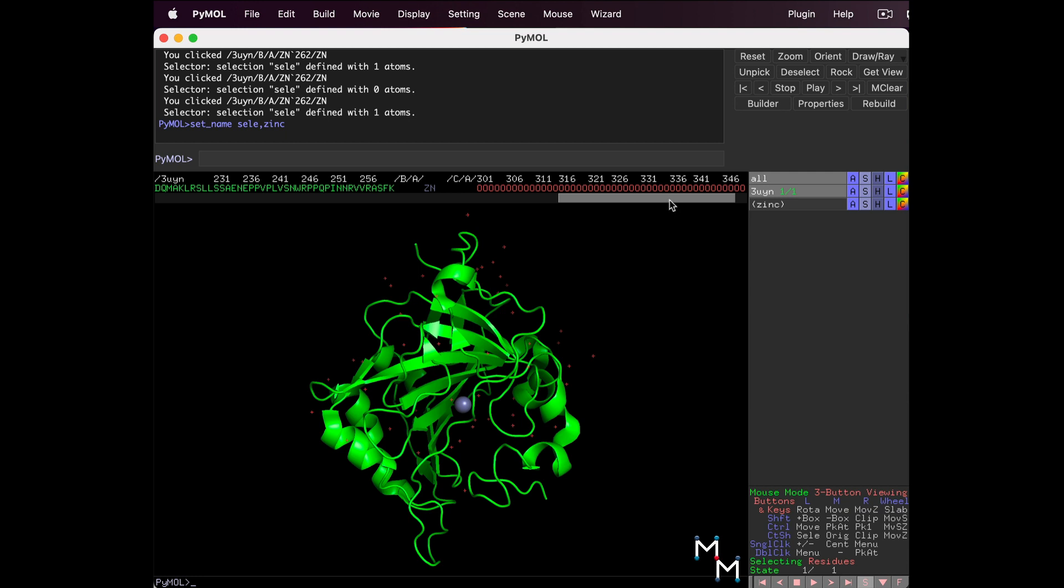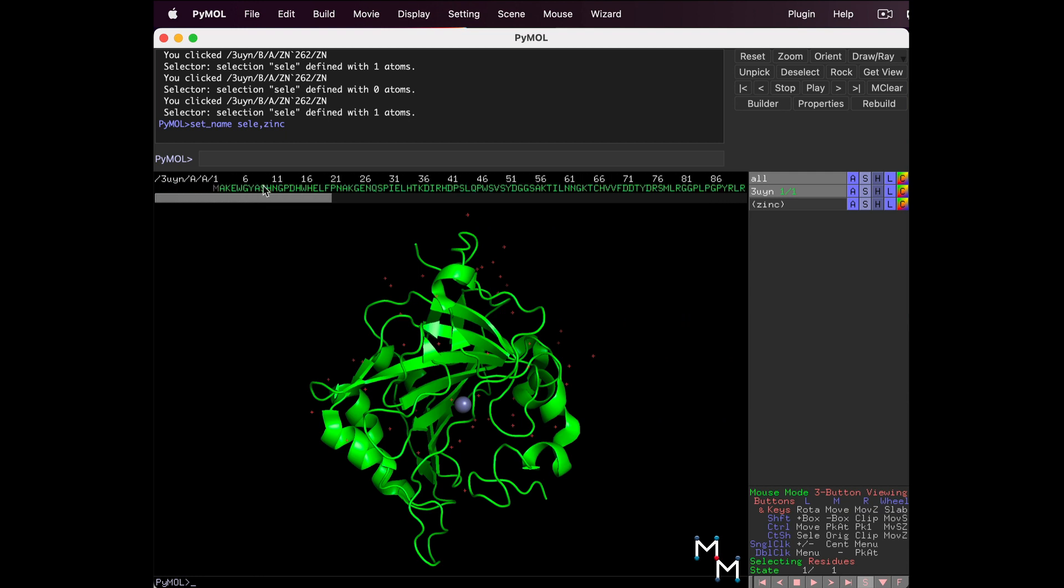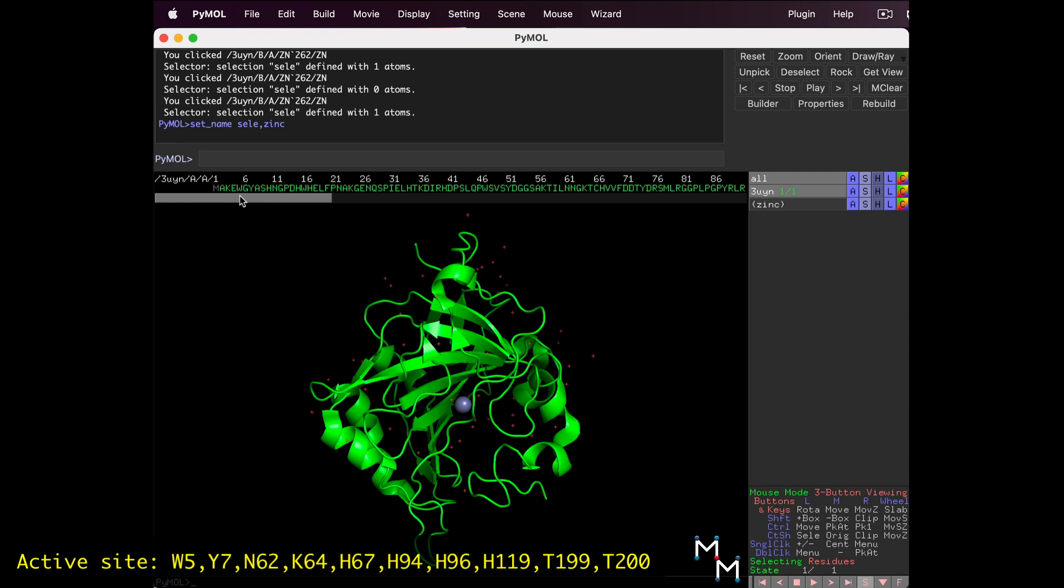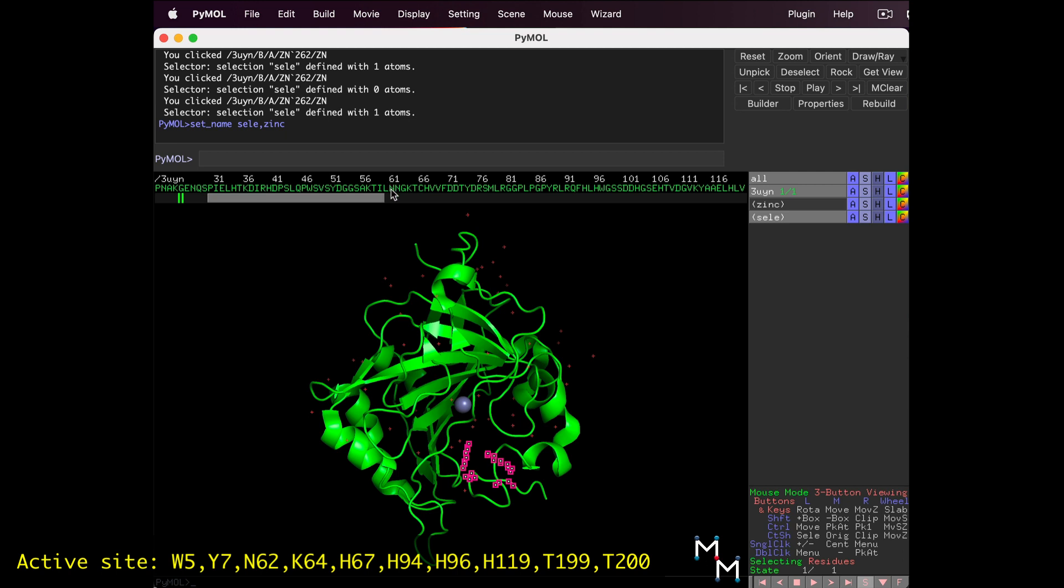Now let's select the amino acid residues that make up carbonic anhydrase's active site. Using the sequence display, scroll back to the amino acids. I'll put the list of amino acids we need on screen. First, we're looking for Residue 5. Notice that Residue 6 is labeled, so Residue 5 is this tryptophan just to the left of it. Click on it to select. Next, we need Residue 7. Then N62. Be careful, there's another N, asparagine, right next to it, so be sure you select the correct one.